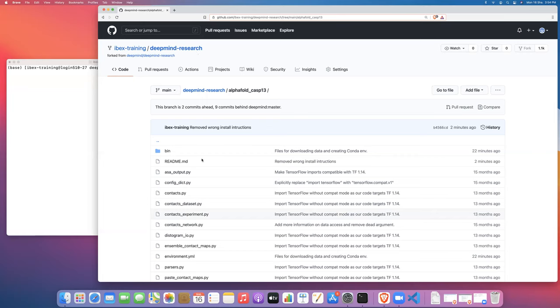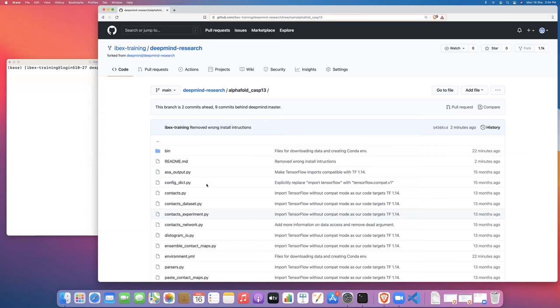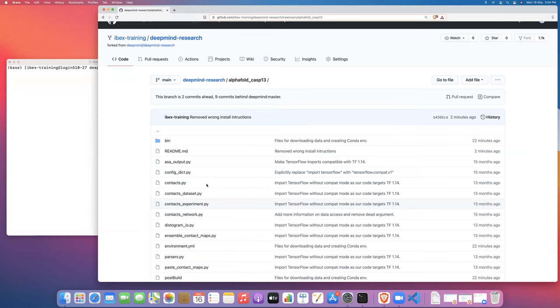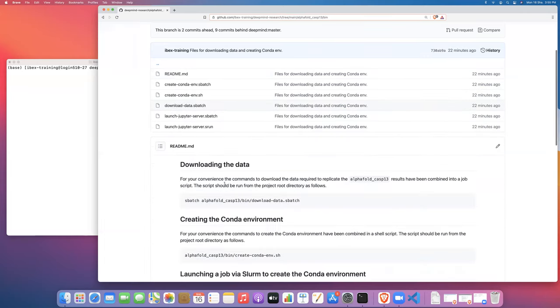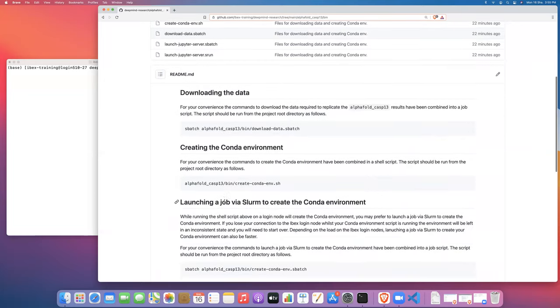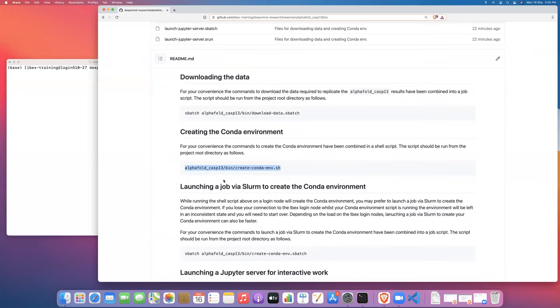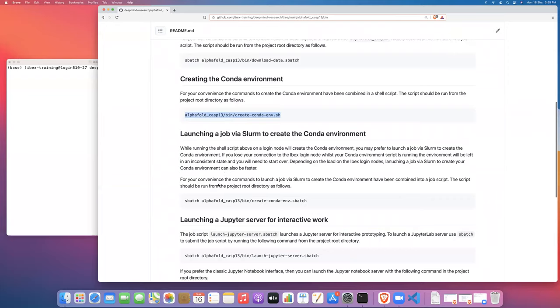You've already run the job script to download the data that you require. So now what we're going to do is run or launch the job that will create the conda environment. If you look inside the bin directory, there are some instructions about how to create the conda environment for AlphaFold. In particular, there's a bash script that you could run that would create the conda environment. And then there's also some instructions on how to launch this conda environment creation as a job on the ibex cluster. So that's what we're going to do today.